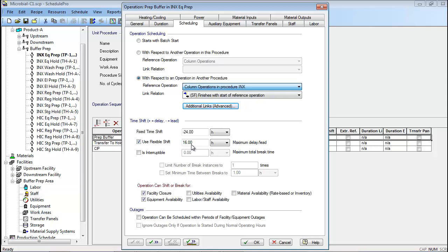Note that for the sake of simplicity, the different chromatography operations typically required within a chromatography procedure — such as equilibration, loading, washing, elution, etc. — were all combined into a single long operation called column operations within these recipes. As a result, all buffers for a given chromatography procedure appear to be fed into the column at the same time. In an actual production facility, the different buffers would be fed sequentially into the chromatography column. To learn more about how to set up the timing between different buffer preparation procedures, please see case C1 in the README file for this example.